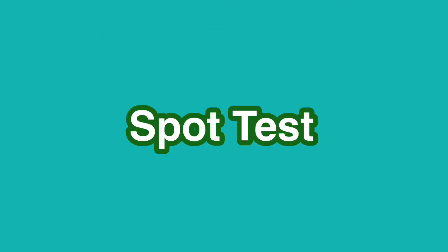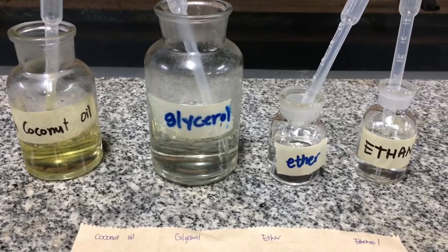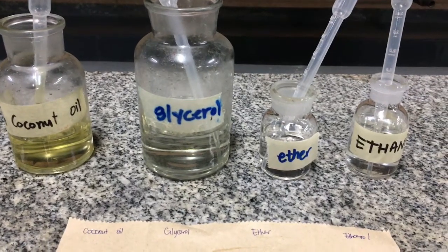The next procedure is a spot test. This is the simplest test for the presence of fats and oils. This is based on the fact that fats and oils leave a translucent spot on papers. This is a common scenario that we usually encounter every day, especially when we buy oily foods wrapped in paper bags. We will be subjecting coconut oil, glycerol, ether, and ethanol to the spot test.